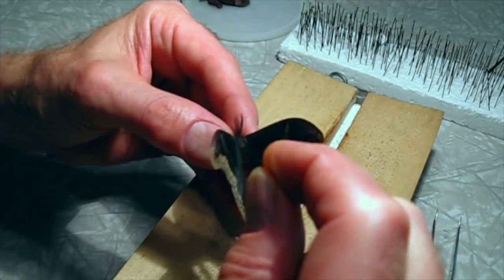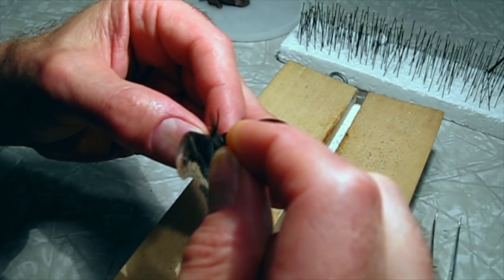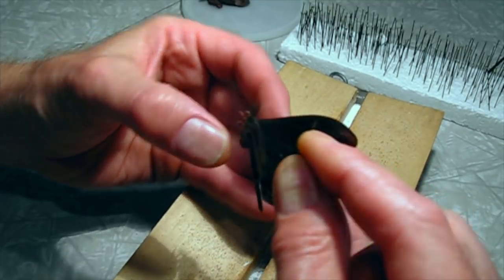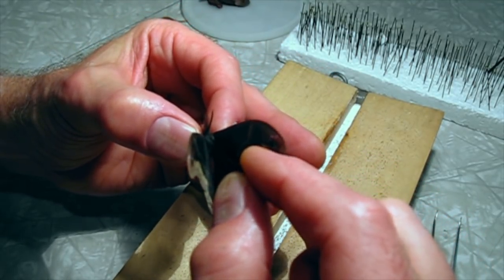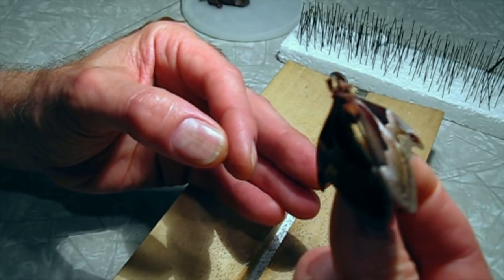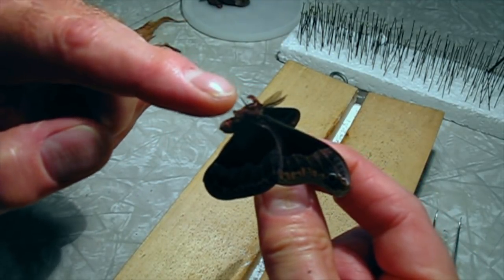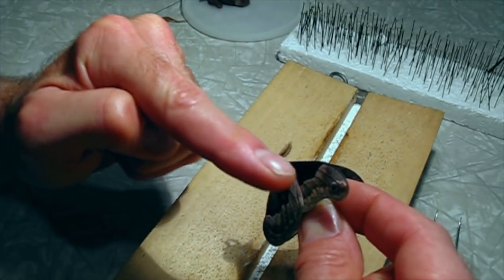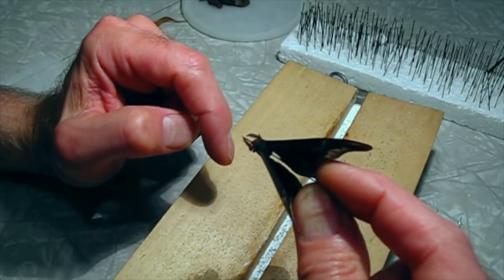I'm going to use a medium-sized pin and get it right through the middle of the thorax. I want to make sure that it's straight — you always want to make sure the pin is straight. You can see in the bottom when you've hit the right spot because it comes through right between the legs, so you've got it through the middle. Make sure it's perpendicular this way and straight through the middle.